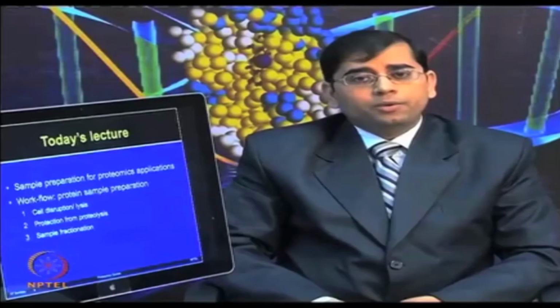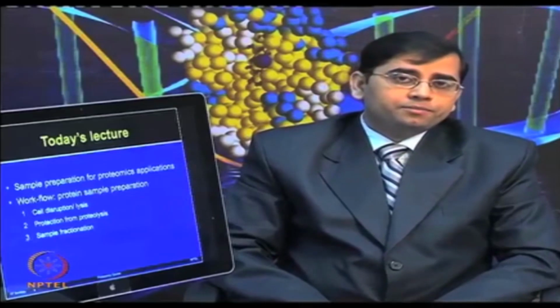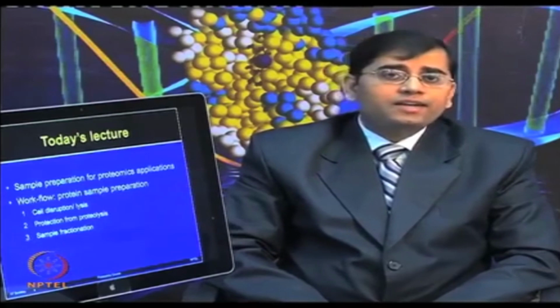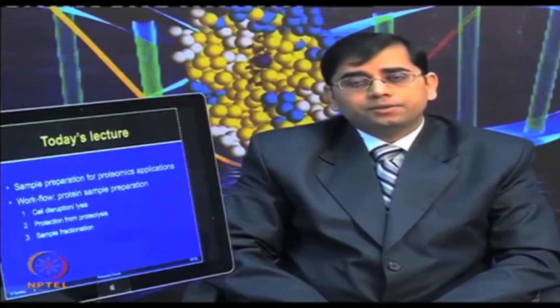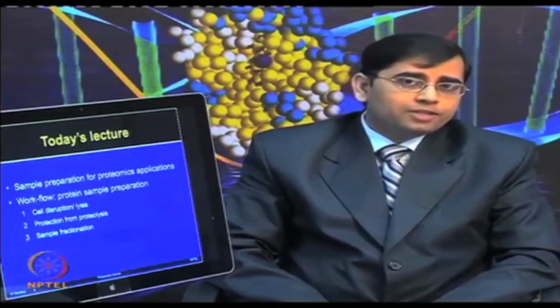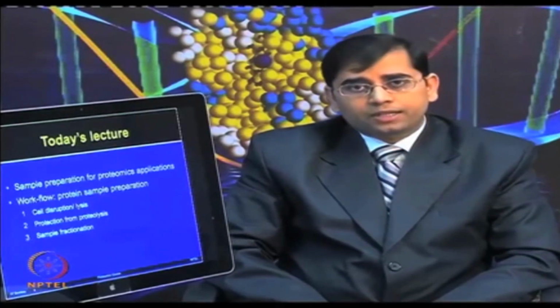Now, when we are talking about the sample preparation, this is quite generic for different types of proteomic application, whether one wants to use gel based approaches or gel free approaches.